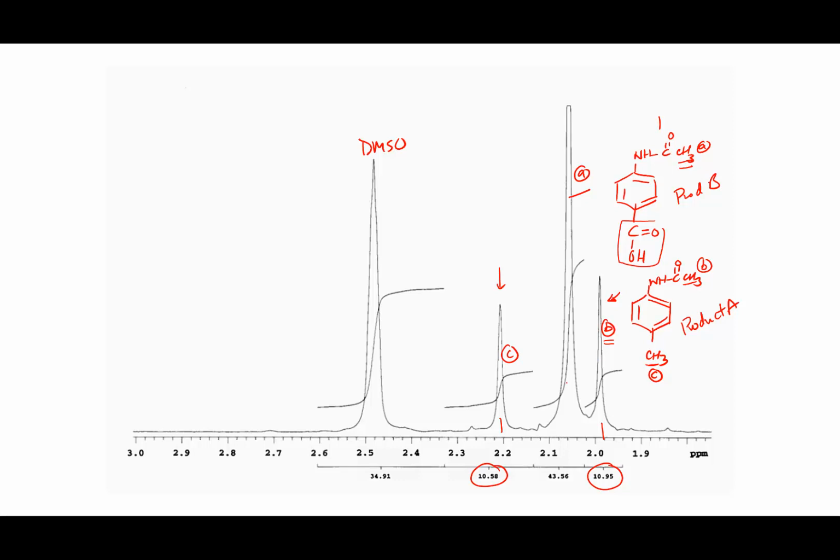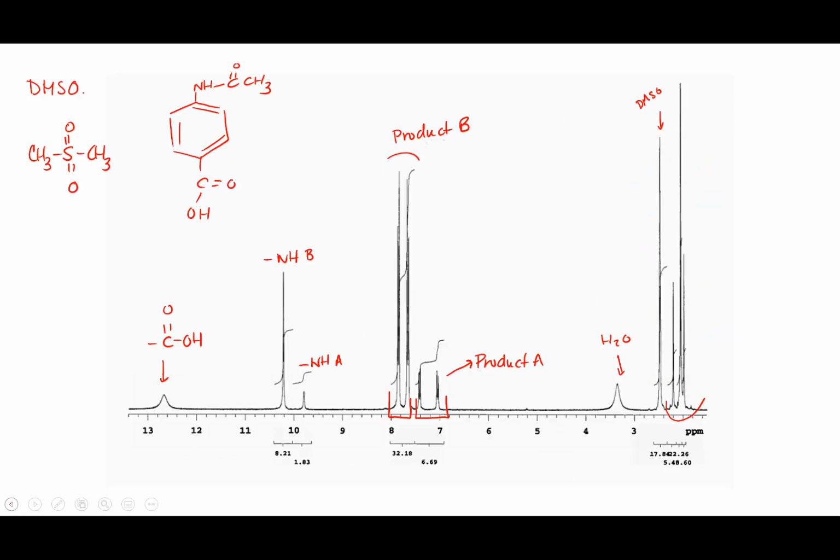Okay, so that's how we can make those assignments. And for the NMR problem that you're going to analyze for your lab reports, I'm going to give you a blow up of this as well. All right, let's take a step back then.